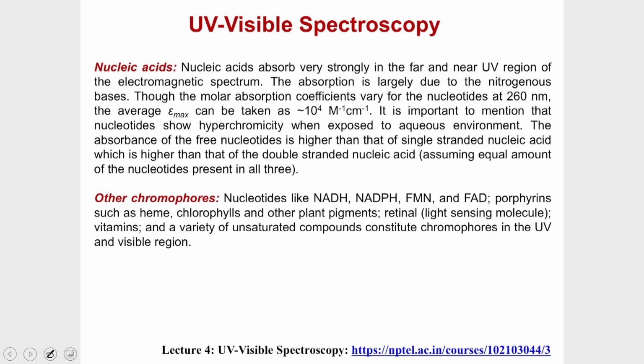It is important to mention that nucleotides show hyperchromicity when exposed to the aqueous environment. The absorbance of the free nucleotide is higher than that of single stranded nucleic acid, which is higher than that of double stranded nucleic acid. Because nucleotides show hyperchromicity, meaning an increase in absorbance, that phenomenon is used to follow the unwinding of a DNA molecule.